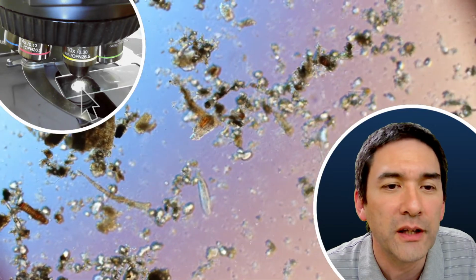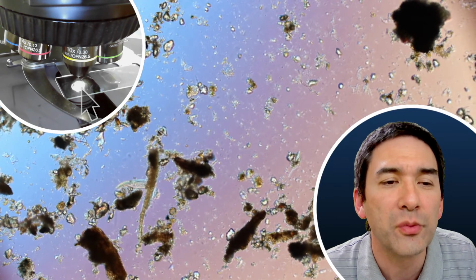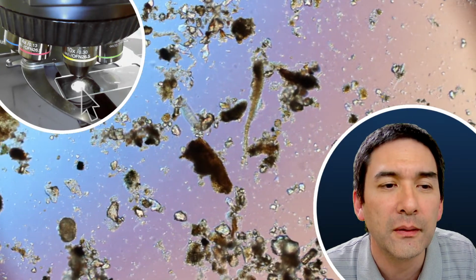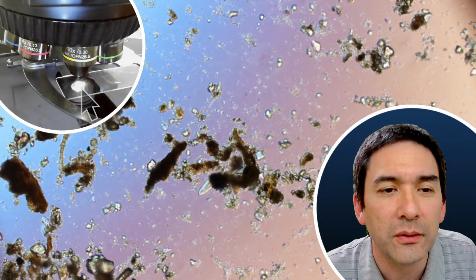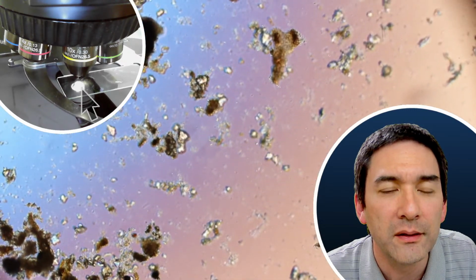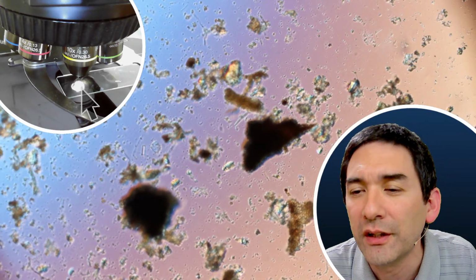So this one over here, look, seems to be a single-celled protist swimming around. But no tardigrades. Here, there's another one over here. You see that because I made the moss sample moist, this also caused some of the other microorganisms to regenerate here.